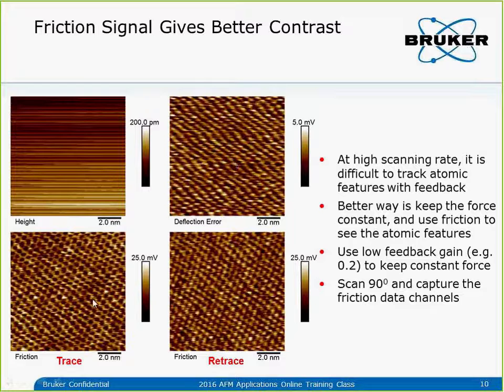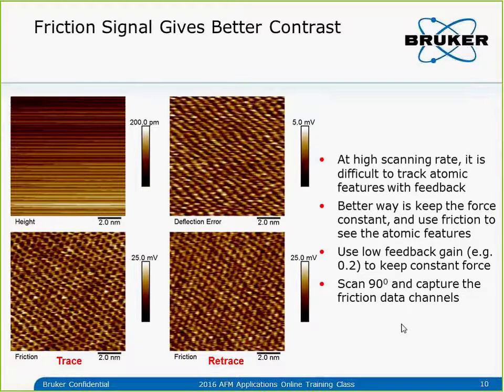The friction signal at 90 degrees shows much better contrast than the deflection error. This is the trace and retrace of the friction signal — you can see the contrast is reversed between trace and retrace, but the contrast is much better than deflection error. The key point is to use low gain just to track sample slope and Z drift, scan at 90 degrees, and look at the friction signal to see those atomic lattice features in contact mode.